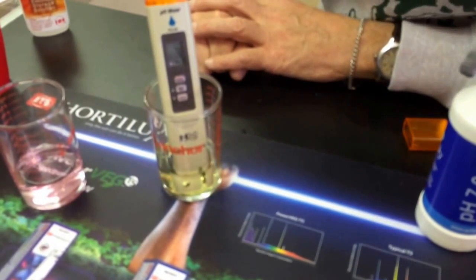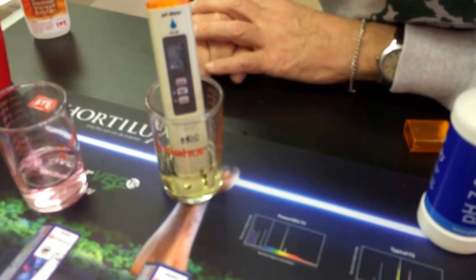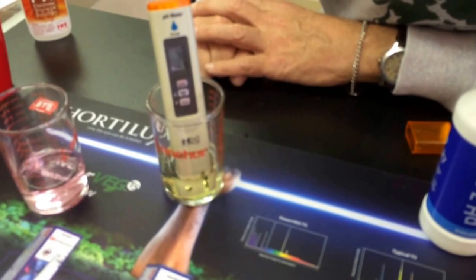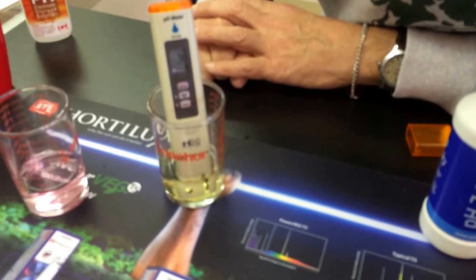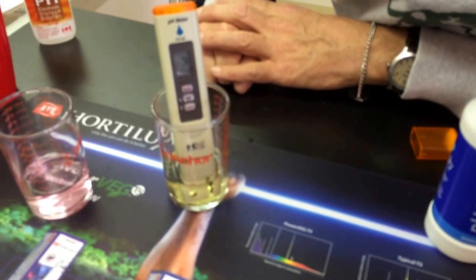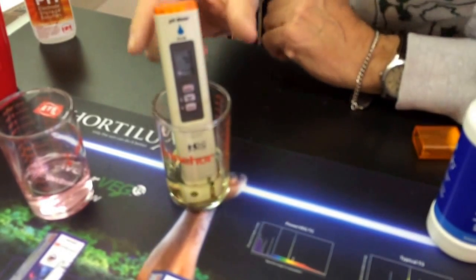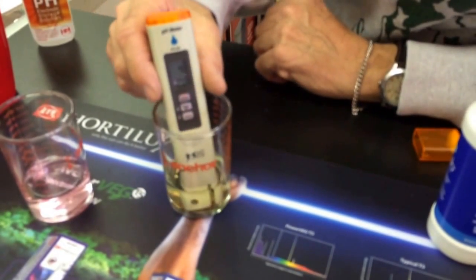It just takes a little bit of time, and then that'll be calibrated. All done. Now it's calibrated to 7.0.